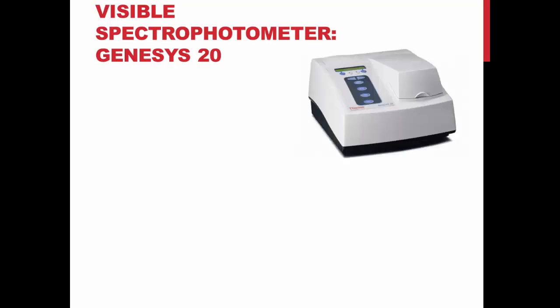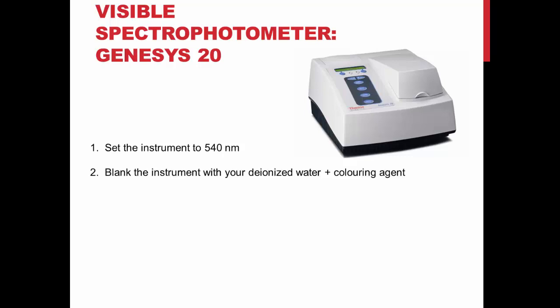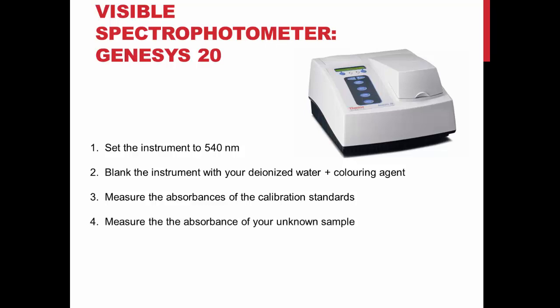To measure the absorbance of your standards, you will need to use a visible spectrophotometer, the Genesis 20. First, set the instrument to 540 nm using the interface on the left of the instrument. You then blank the instrument with your deionized water and coloring agent. Now you can measure the absorbances of the calibration standards. You do not need to adjust anything on the interface — simply remove the blank and insert each standard. You will then measure the absorbance of your unknown sample and repeat steps 2 to 4. An additional video is available on how to use the instrument; however, your instructor will demonstrate this in the lab.